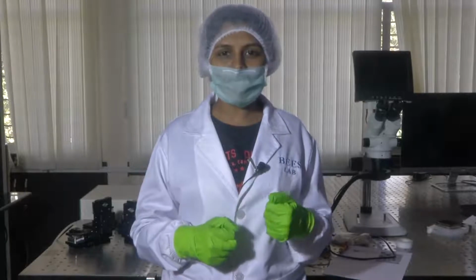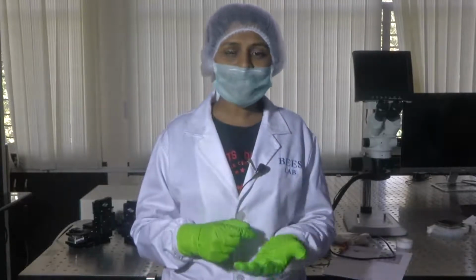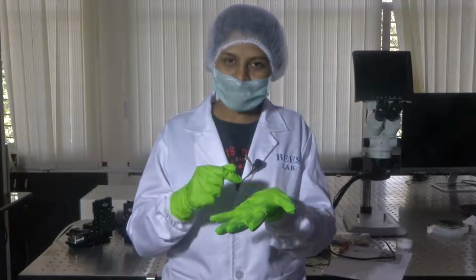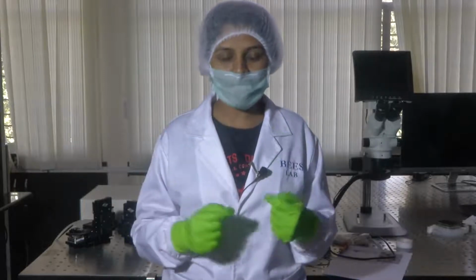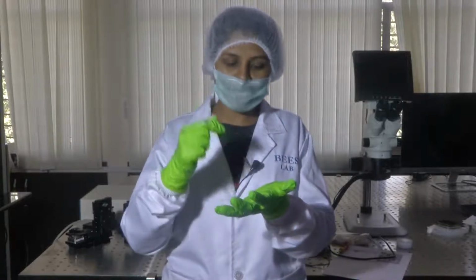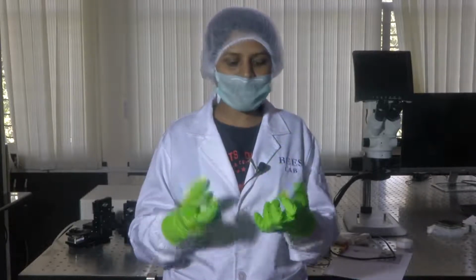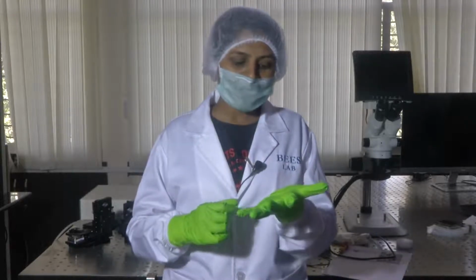So, when we are talking about cells and tissues, we are talking about micron scale. Now, how do we indent them? They are very minute features, and indenting or palpation is not possible just using our hands or fingers. Precise force needs to be applied on a very small scale. How could we precisely get the amount of force on the samples?